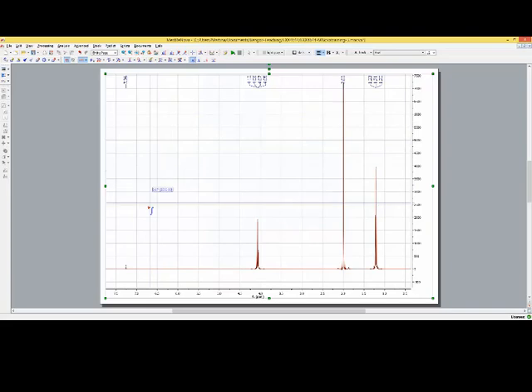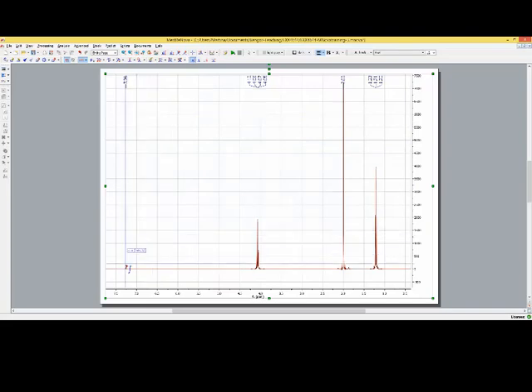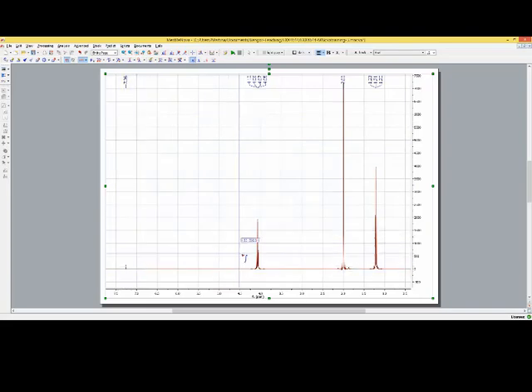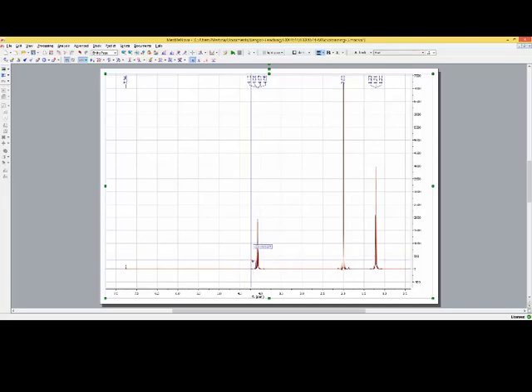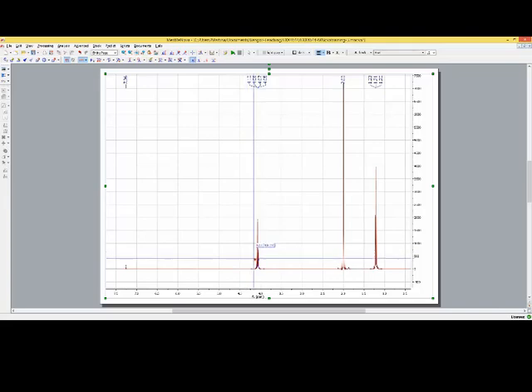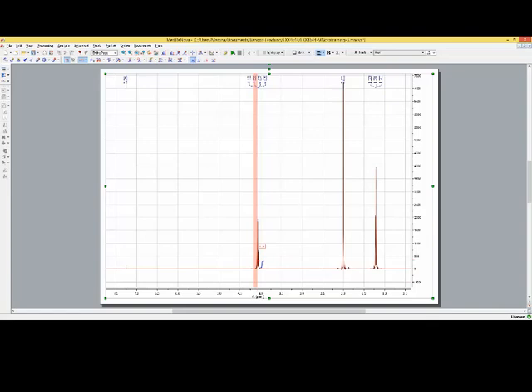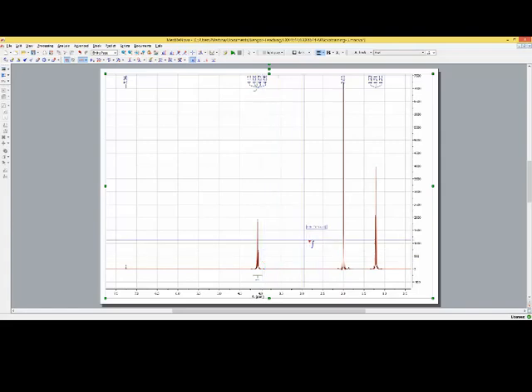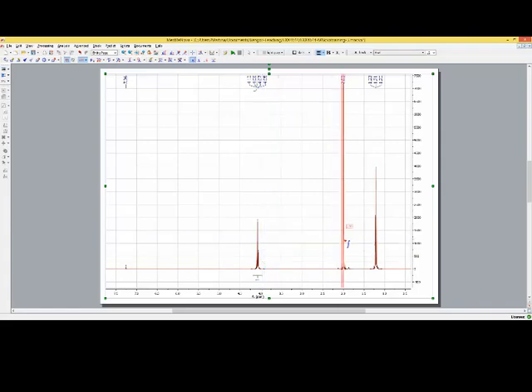So now we have an integral as our mouse pointer. We don't want to integrate our NMR solvent. That doesn't make sense. We start on a signal which looks like it comes from our compound. We move again our mouse pointer to the left hand side of the signal, hold the left mouse button down and drag it over and then we release it. And we repeat this for all our signals.